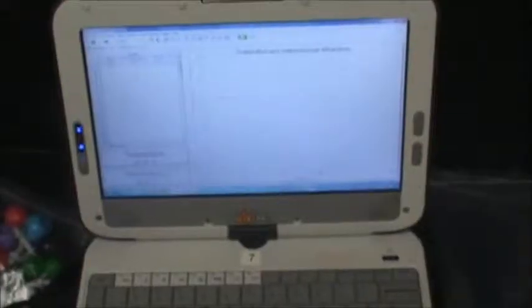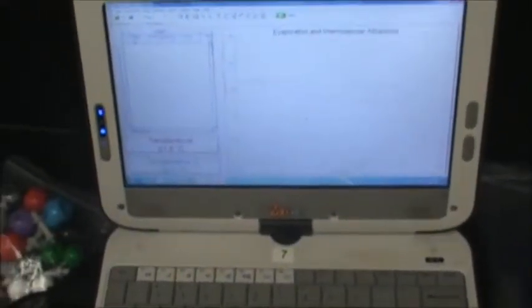So here it goes, on to steps 3 through 9. I'm going to take my pentane and my hexane. I'm going to start collecting my data, just like shown here. Click it. I start to see data being collected. It's going to go for about 15 seconds, and then I'm going to remove my temperature probes. There it goes. I'll try to be as steady as possible, getting this on the camera.